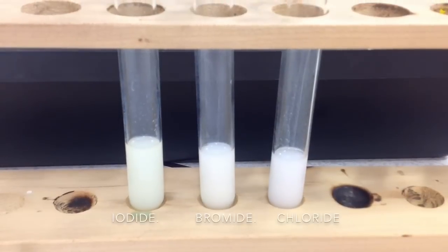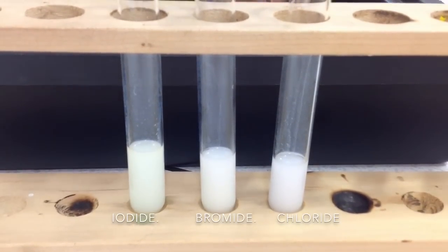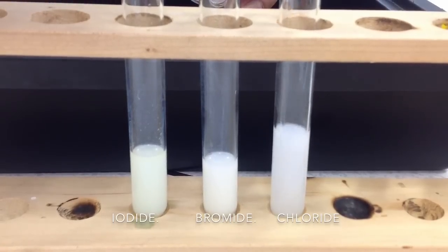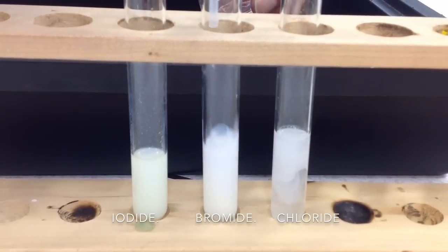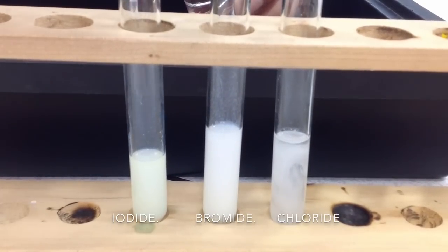I'm now going to add some dilute ammonia to each test tube to see what happens. Here we are, going into the first, into the chloride, and into the bromide, and into the iodide.